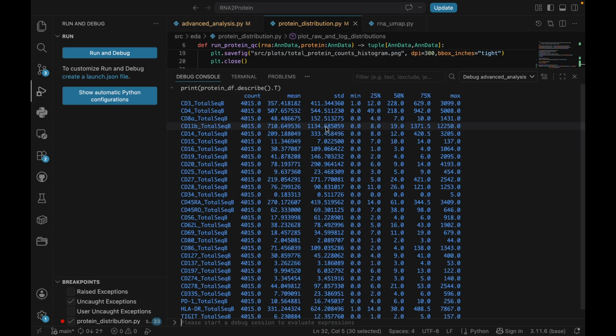To get around this, besides doing the log transformation, we should probably do something called centered log ratio, if you're not already familiar. But yeah, if we don't fix this, then any model will treat the high cells as extreme outliers, and the near zero cells all look identical to it. So no resolution between them. But there are ways to fix that.